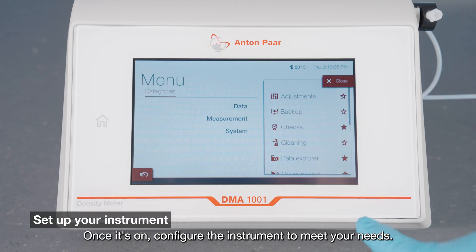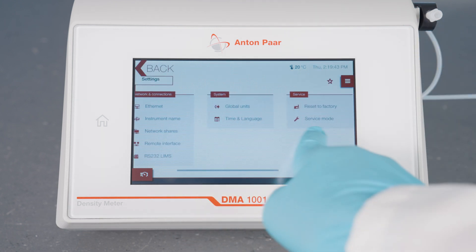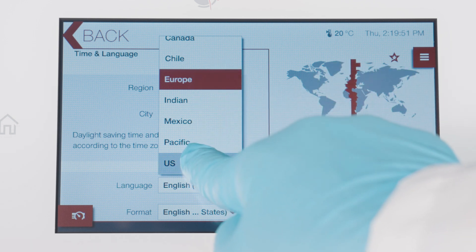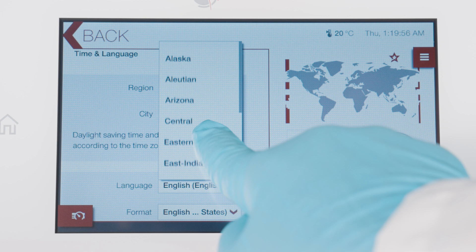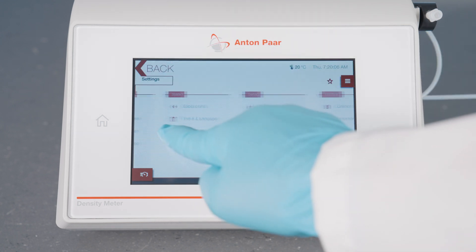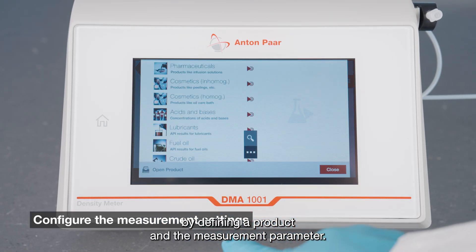Once it's on, configure the instrument to meet your needs. Then configure the measurement settings by defining a product and the measurement parameter.